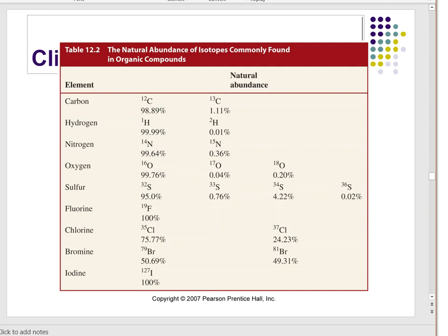All right, so up here at the top is my carbon-12 and my carbon-13. This is going to be an M+1 peak. It weighs 1 extra. Here's hydrogen. Hydrogen-1 and hydrogen-2. We call this deuterium. Pretty important. That was UV vis. Old light bulbs used to be made of deuterium till they changed them up on us. This is also an M+1 peak.